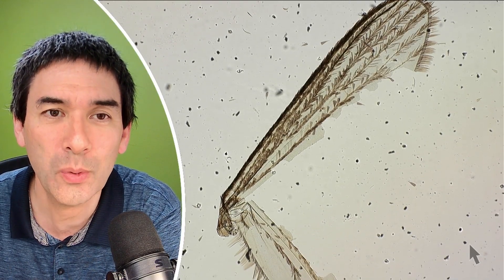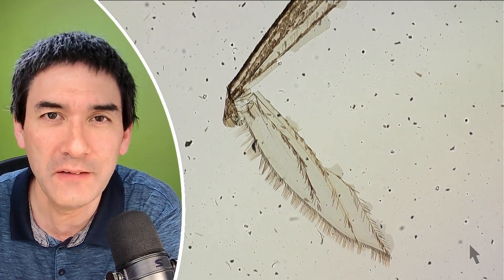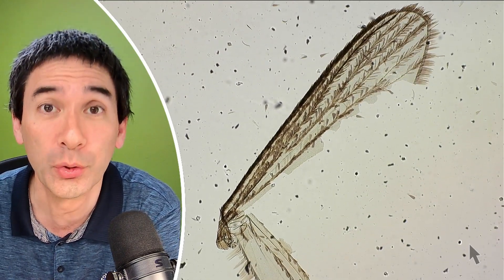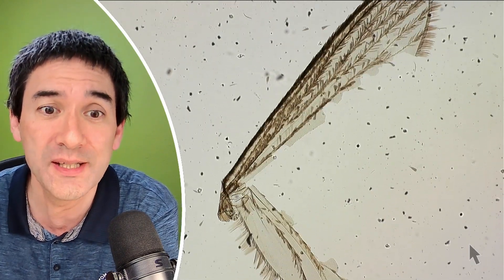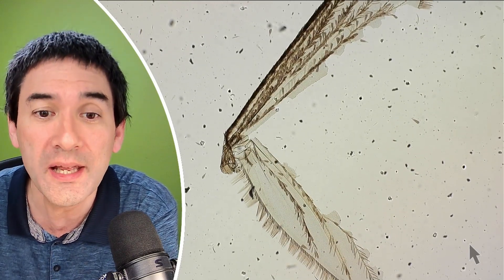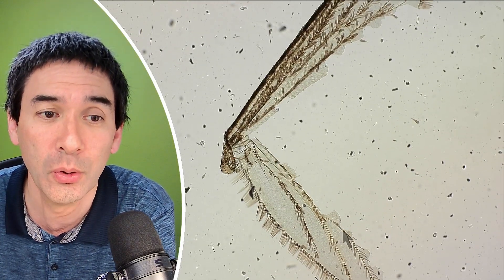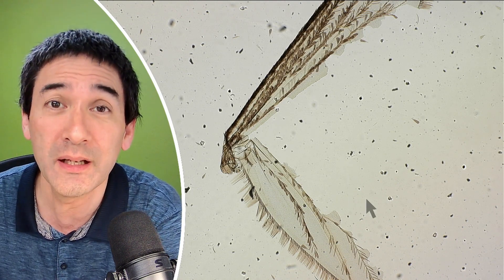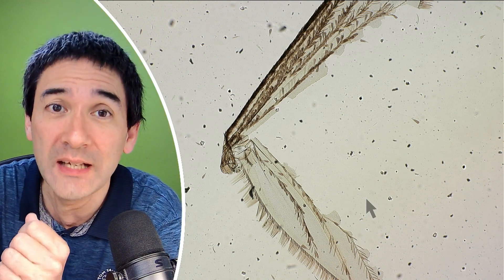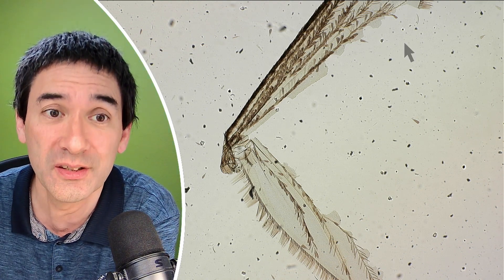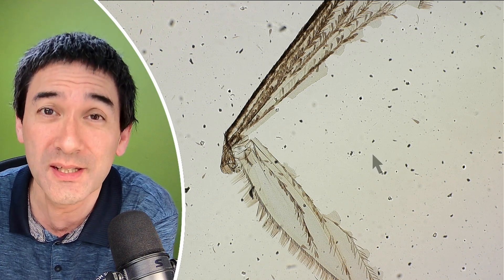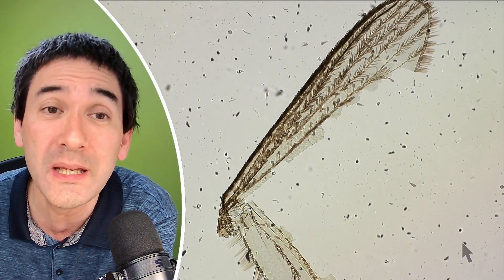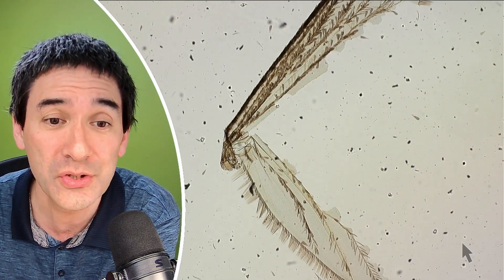So here, this is the mosquito wing, and what do you notice? It looks very, very, very, very bad. Oh, gosh, this is horrible, really. What happened? Look, it's torn apart. It's actually one wing that we have here, but actually, it's separated into two wings. This was not the way when I mounted the slide some time ago, but why is it torn now? And the reason is because as the mounting medium dried, it exerted a tension, a strain on the specimen, on the wing, and this caused the wing to rip during the drying process. So basically, you see, just because something's mounted properly does not mean that it's also stable over the long term.